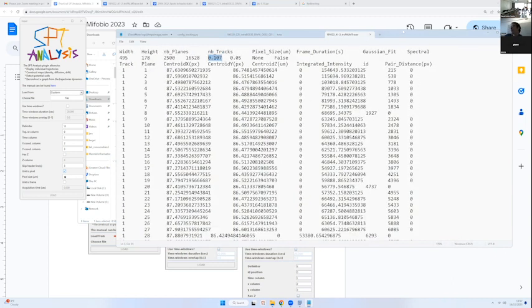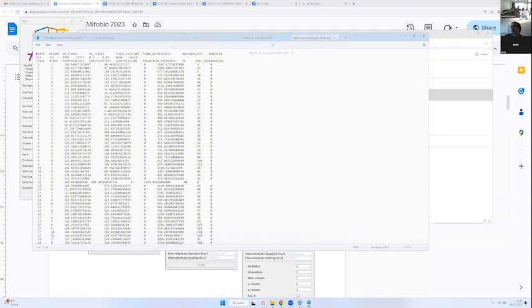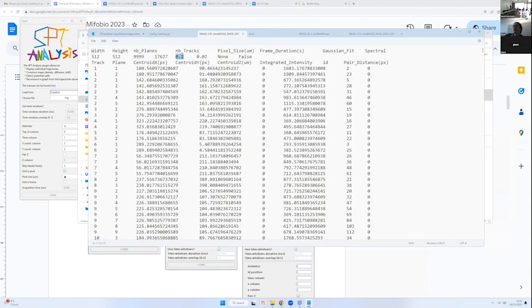Sorry, it's not in the file, whatever. These files have the same format. Okay, so our pixel size is 0.1 micrometer, so we can write it here. And the acquisition time, same thing, is 0.02. Right, so skip header length 3, unit is pixel checked, pixel size 0.1, unit is frame checked, acquisition time 0.02, and all the other parameters are already correct.